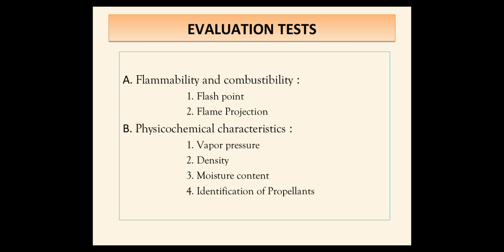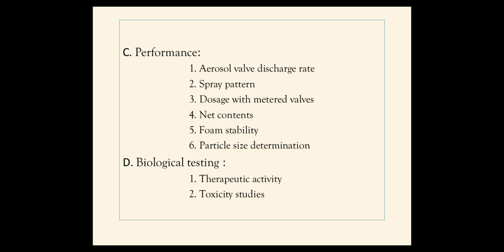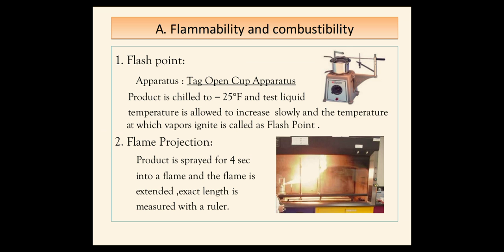If they ask for the QC test, then you have to write whatever we have explained till now, and also the pharmaceutical testing, aerosol testing, or evaluation test, so you have to write all of these. Flammability and combustibility test, flash point, flame projection, and various physicochemical characteristics. Performance and biological testing. We are going to see them one by one in detail.